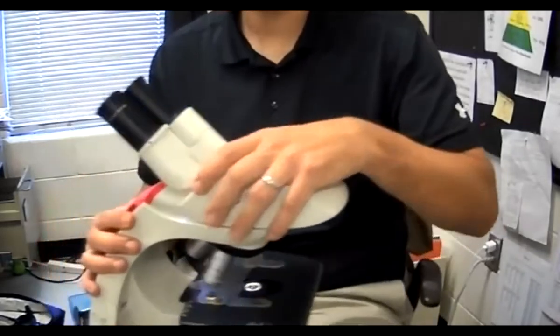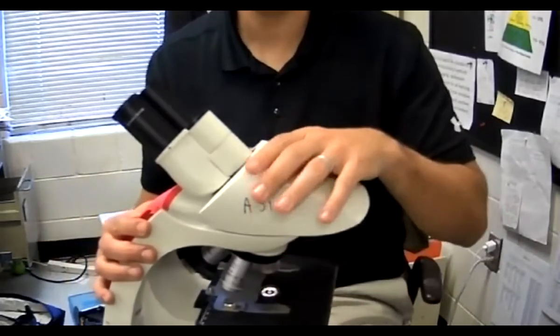This part right here is the body tube. The part I'm touching right here is the body tube.